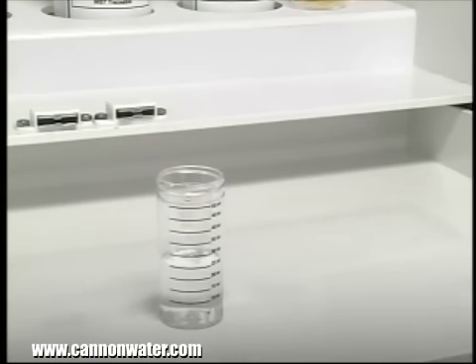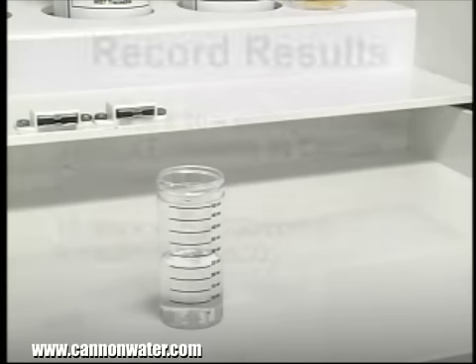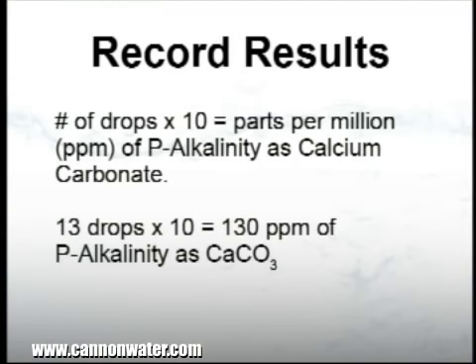According to the endpoint ID procedure, the titration is complete when the sample changes from pink to colorless. In this example, each drop was equivalent to 10 parts per million of alkalinity. The sample took 13 drops to reach the endpoint. Therefore, the p-alkalinity of our sample is 130 parts per million as calcium carbonate. Write down this result and continue with the test.